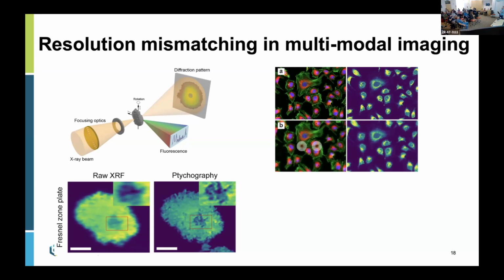On the other hand, if we know how the wavefront looks like, for example, from ptychography reconstruction, and we know physically how the measurement was done, we know exactly the spacing of the steps, we can apply a deconvolution process to restore the fluorescence image.